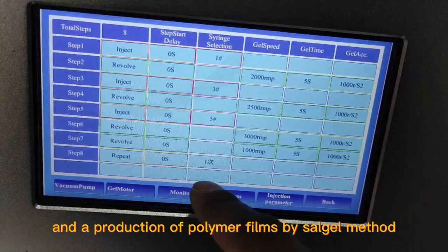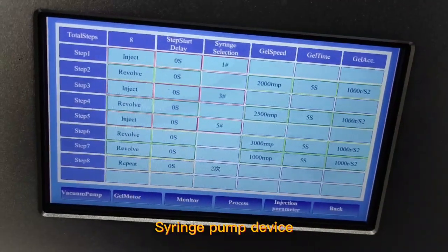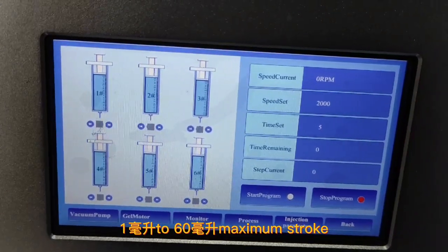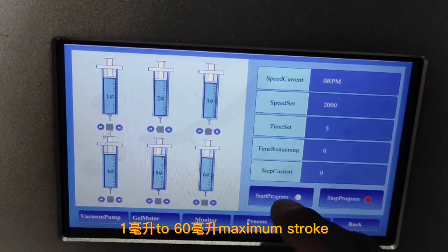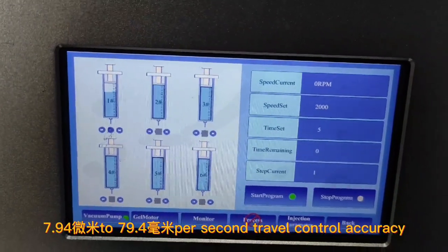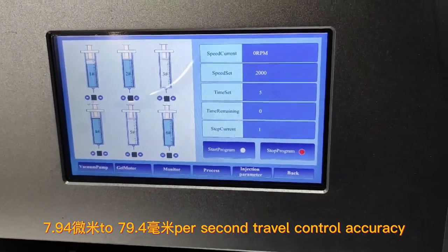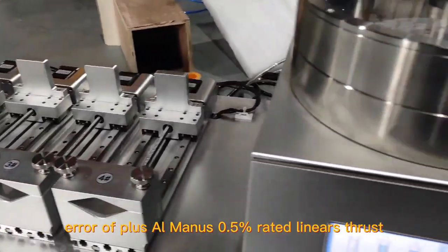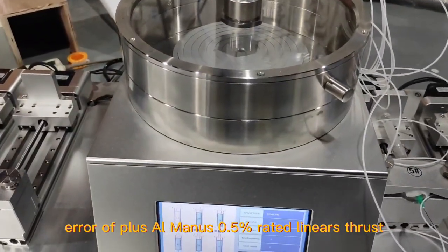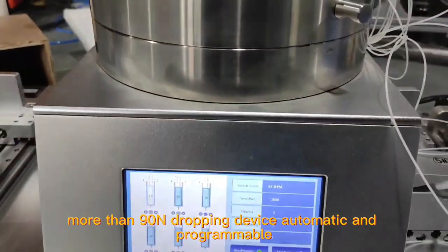Syringe pump device: applicable syringe specification, 1毫升 to 60毫升; maximum stroke, 90毫米; linear speed range, 7.94微米 to 79.4毫米 per second; travel control accuracy, error of plus or minus 0.5%; rated linear thrust, more than 90N; dropping device automatic and programmable.